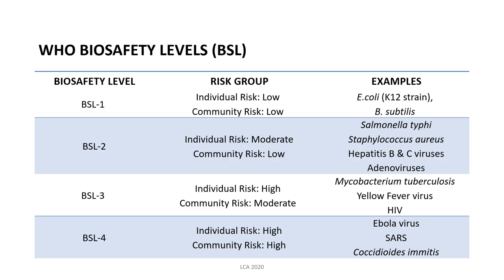We start first with BSL 1. BSL 1 is the lowest bio-safety level and is applied to agents which pose the least threat to the lab worker and the environment. Examples of microorganisms under bio-safety level 1 are the non-pathogenic strain of E. coli — the K-12 strain — and Bacillus subtilis. If a person or the community is exposed to these microorganisms, they do not pose severe or fatal disease to the individuals.